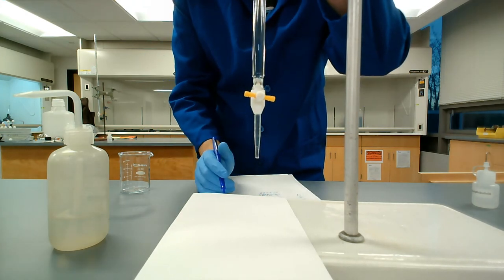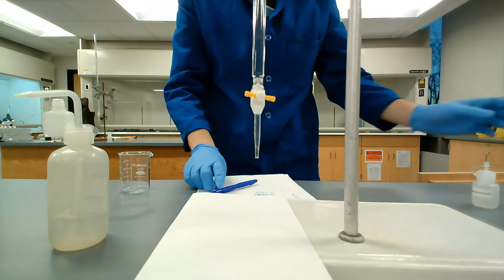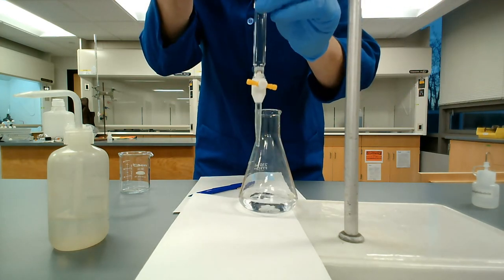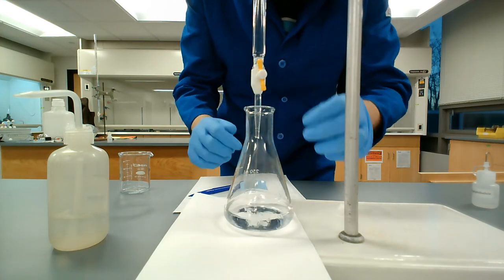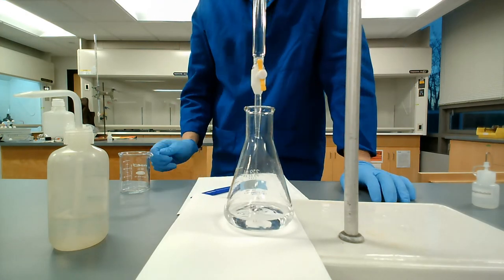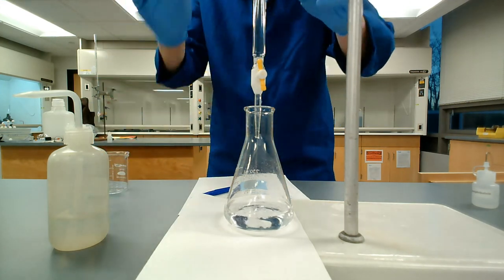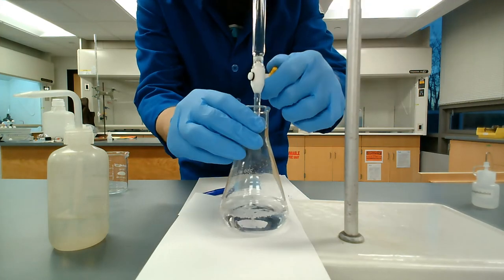I'm pouring it at like waist level rather than above my head on the desk. If I were filling it on the stand, I would probably use a funnel to prevent spillage. The issue that I run into with that is I frequently, not frequently, but can be impatient and overfill the funnel, and then the whole thing overflows everywhere, so it's a disaster. But anyway, open the burette wide open at the start, just let it go.